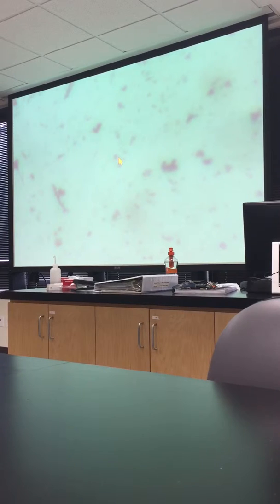Okay. Let me do oil immersion actually. This is a bad example. On the practical, I don't expect you to do an oil immersion. You should be able to tell what it is without having to do oil immersion, because I don't want to have to present you with oil.